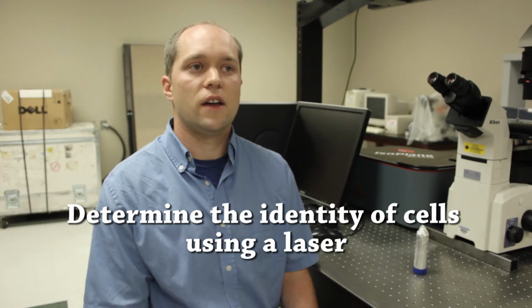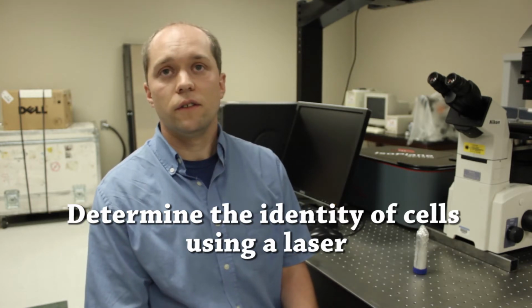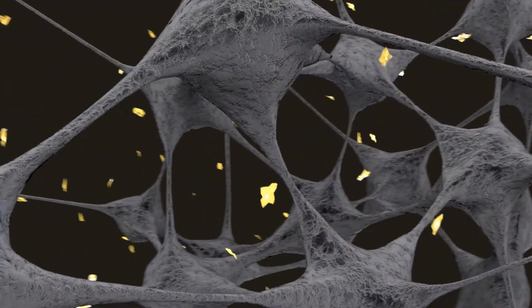One of the downfalls of Raman spectroscopy is that it's very insensitive, so the intensity of the light coming off of the cells is not very strong. So I'm using these gold nanoparticles. When you place those next to a cell, it will significantly enhance the light that's reflected off of that cell.